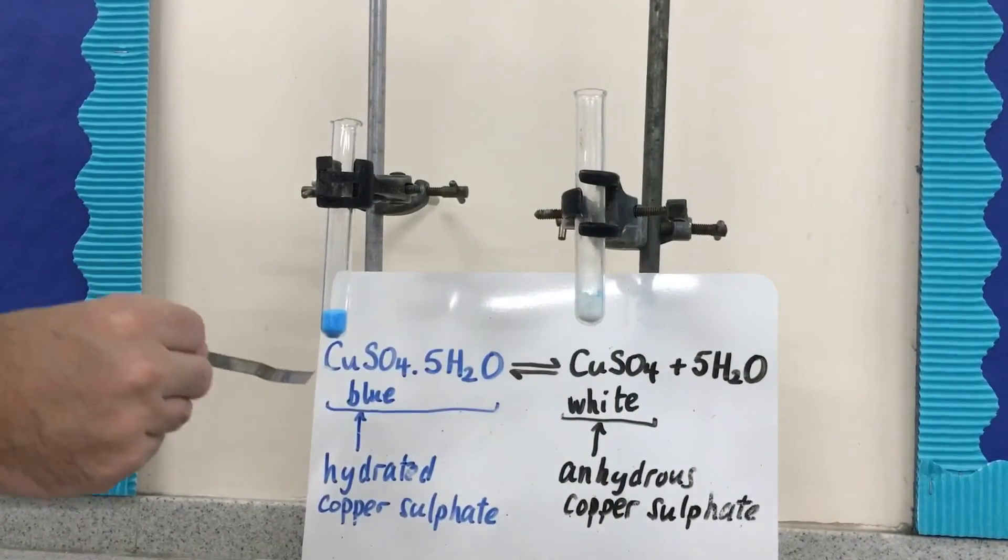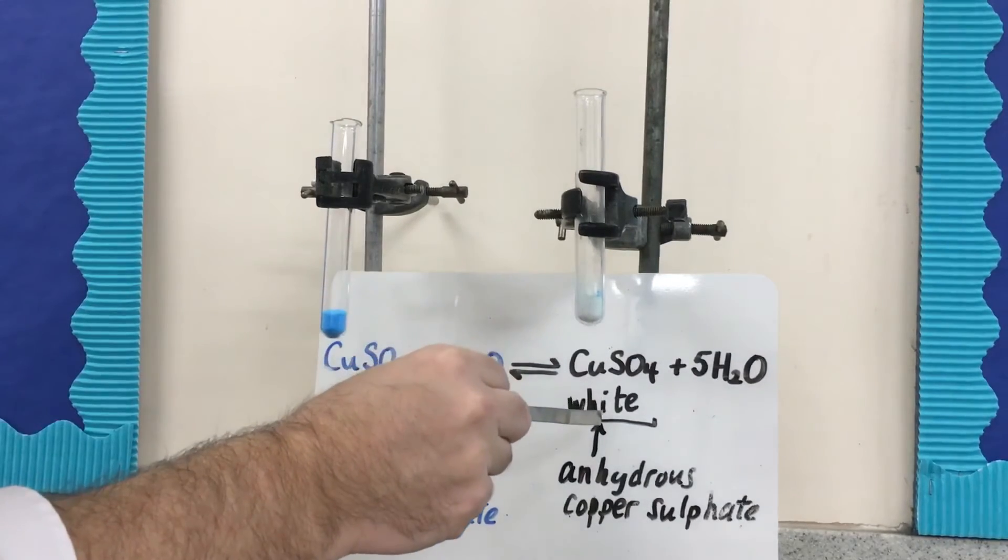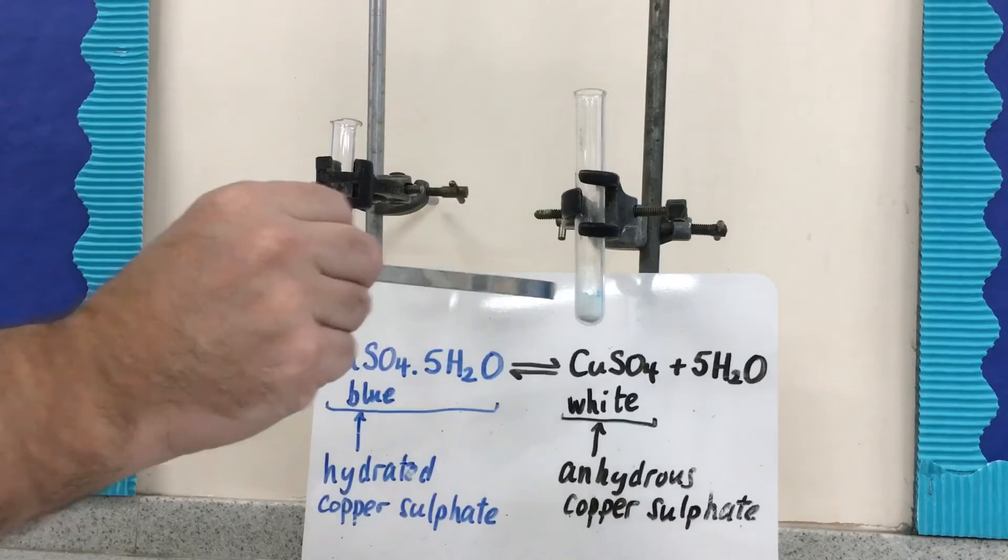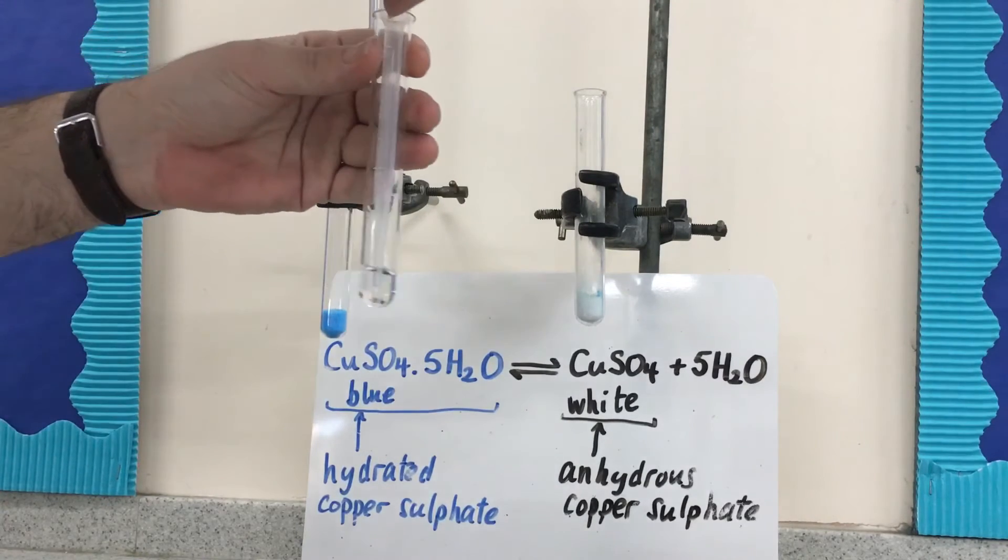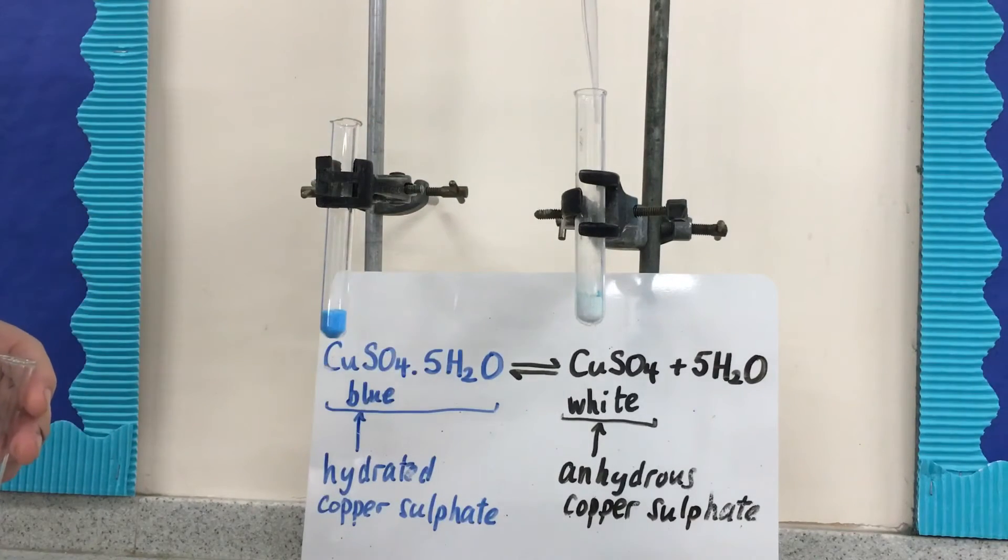Because we know that blue copper sulfate turns white when water is removed, we can turn anhydrous or white copper sulfate blue by adding water. So if anhydrous or white copper sulfate turns blue when a liquid or solution is added, we know that the liquid or solution that we're adding contains water. So this is some water. If we add it to our white copper sulfate, it'll turn blue.